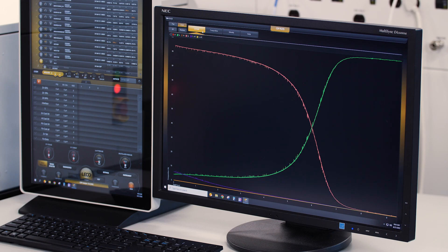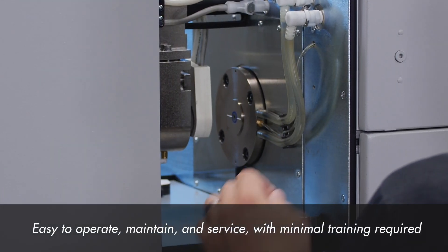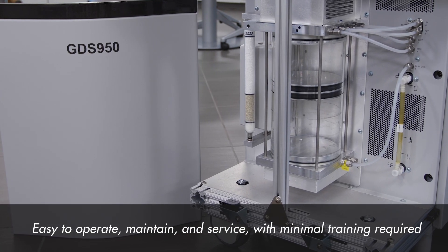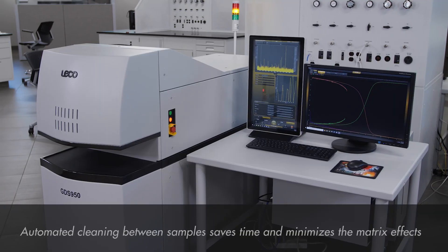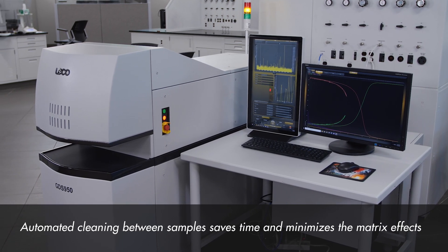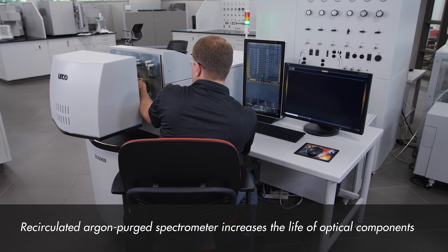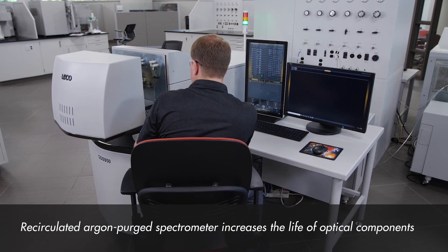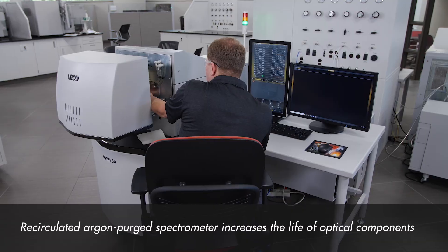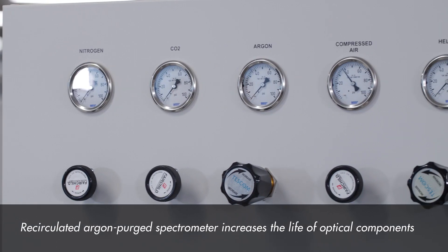The intuitive design of the Cornerstone GDS series makes this instrument very easy to operate, maintain, and service with minimal training required. The automated cleaning system between samples saves time and minimizes matrix effects for increased precision, while the recirculated argon purged spectrometer increases the life of optical components and eliminates the need for multiple gas sources and associated accessories, lowering the cost per test.